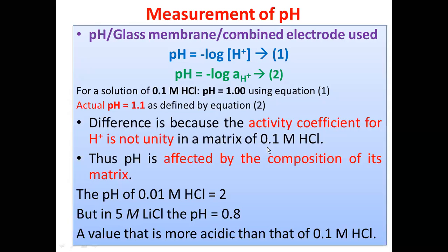Therefore, we can come to the conclusion that pH is dependent on the composition of the solution for which we are going to measure the pH.